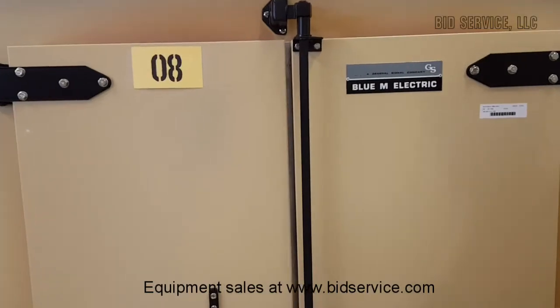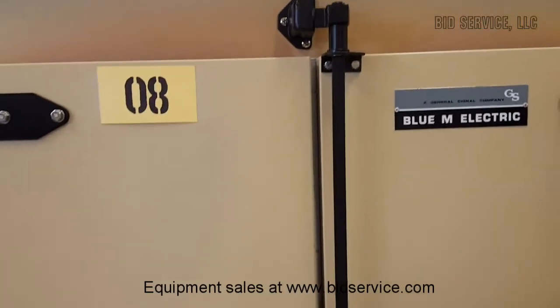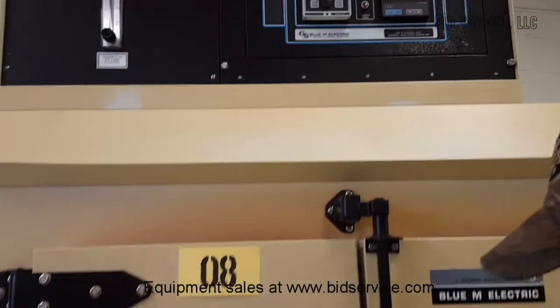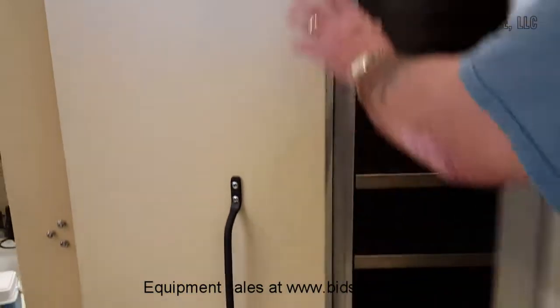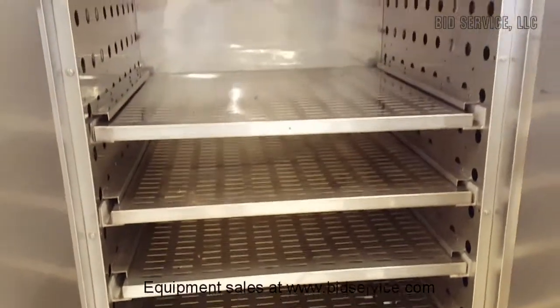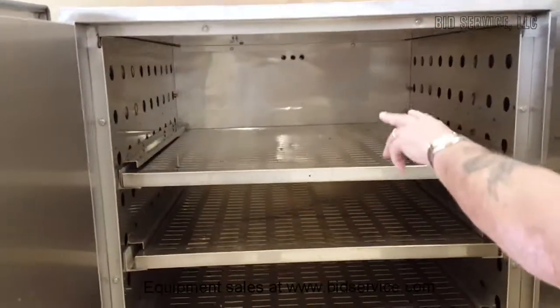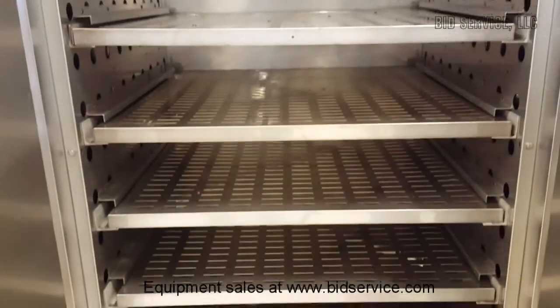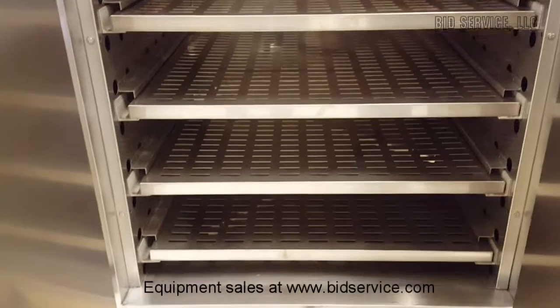The Blue M DC 366 EWAS oven. Open the door here, take a complement of shelves. In the back center there are sensors — those are for the over-temperature and the standard temperature monitoring.